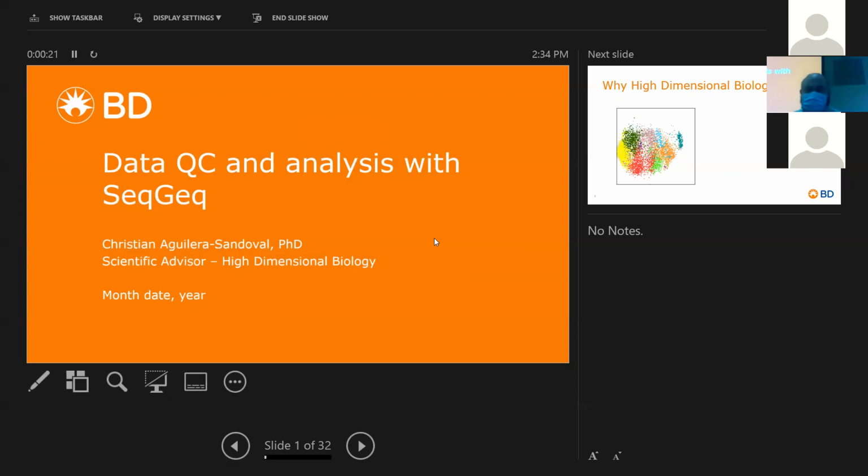Hi, everyone. So I was asked to give a talk on multiomics rather than the high parameter analysis with flow cytometry, but there'll be a talk on high parameter analysis with flow cytometry tomorrow afternoon with Veronica. Today, I'm going to be covering also high dimensional biology analysis, but with multiomics. So an added layer of complexity, but also a more comprehensive way of analyzing your data.